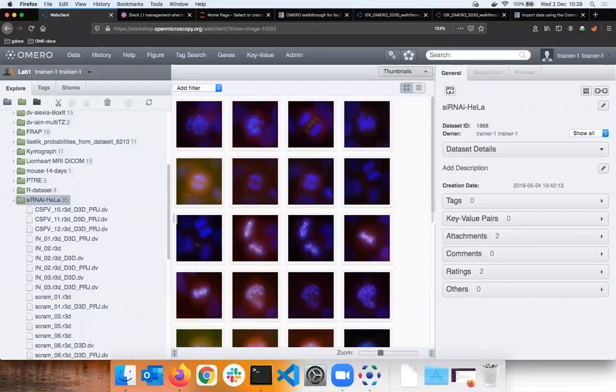When the user acquires the data, they say, I want those 5, 10 or whatever images imported, but they don't want to import right this minute. They want to say, I want them imported. So they select them and click offline import. And there is a job on the acquisition machine that will automatically import them for them on their behalf. The reason they do that is that you only have an hour, 2 hours on the acquisition machine, and you don't want to wait another half an hour for the images to be imported. So that is that option.